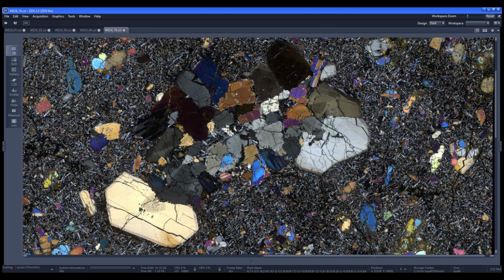Again, this is on a software, so I'm kind of limited, and you can do a whole lot more with an actual microscope, which would be really cool. But maybe that'll be a future project when I have more money and time, because I have hardly any time right now.